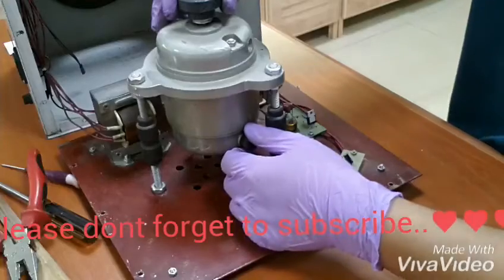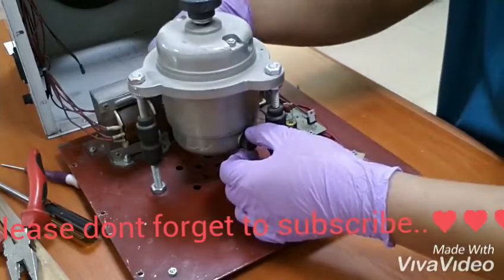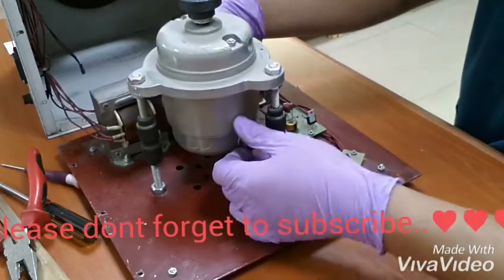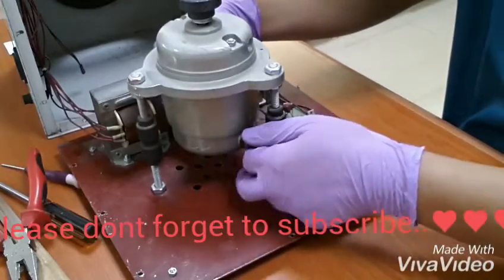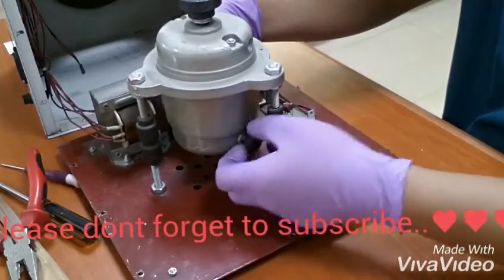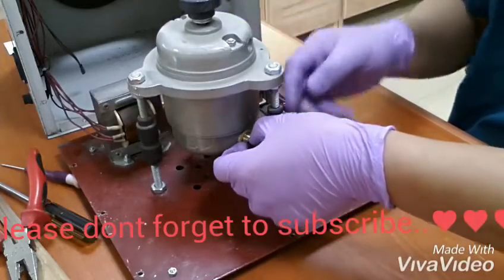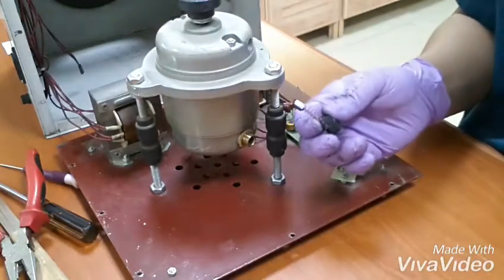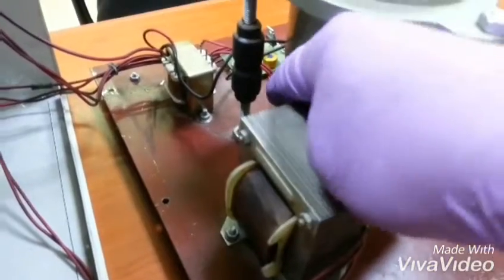We will check the carbon brush, because the most common problem for a centrifuge is the carbon brush. This is where the carbon brush is, and here is the other side.